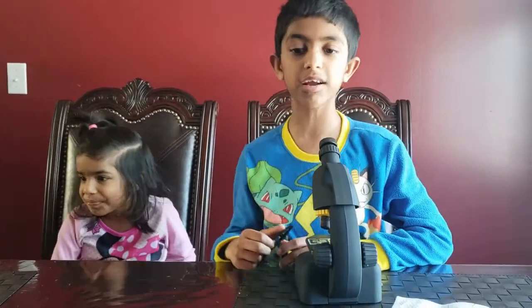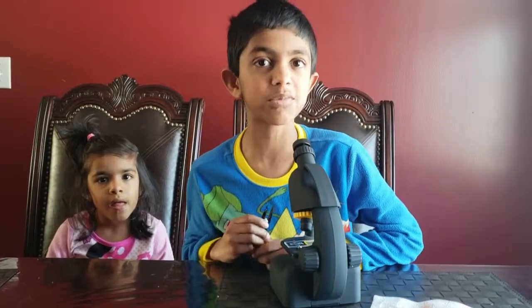Hi, this is Auro. Hi, this is Ava. And today, this is my very first microscope. Today, we're going to do some experiments with it.